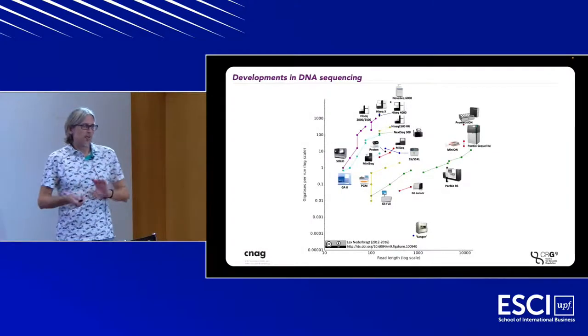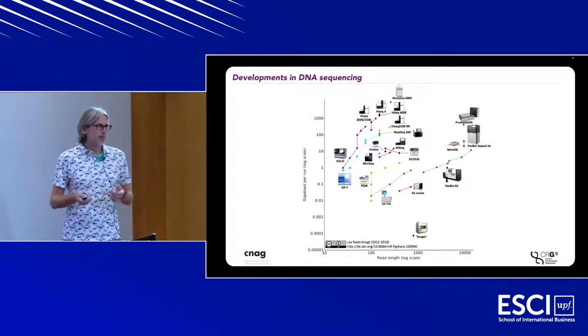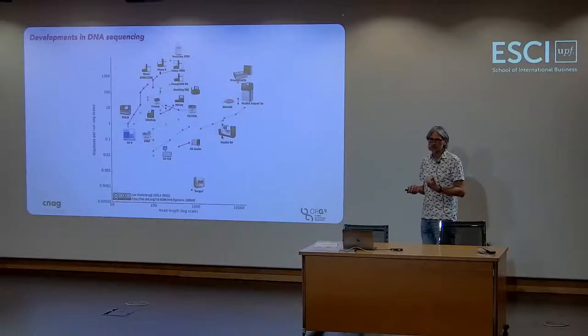So before talking about assembling reads, we have to talk about the sequencing technology. Has everyone heard of Illumina? Okay, who has not heard of Illumina? No, I don't want to point anyone out. Everyone's heard of Illumina, right? It's a big DNA sequencing platform company.